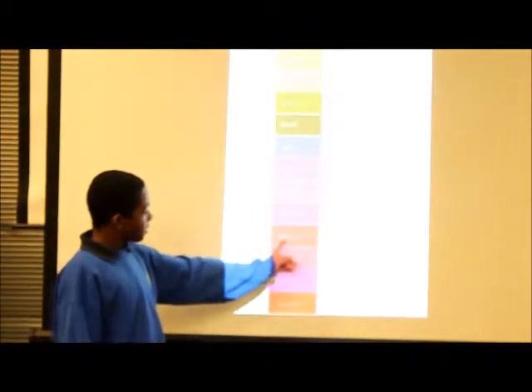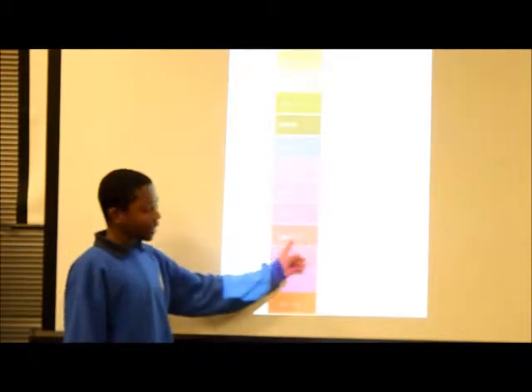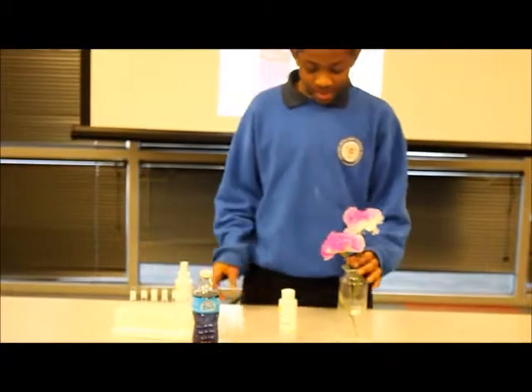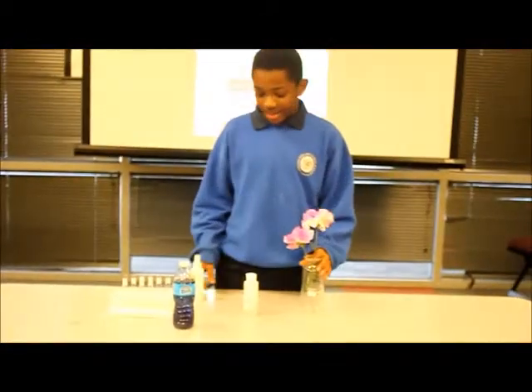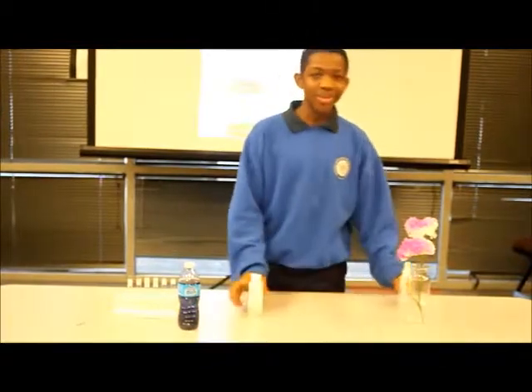This is a base, which is pH 11. These are determined to tell which is an acid and a base. Now, on to the next experiment.